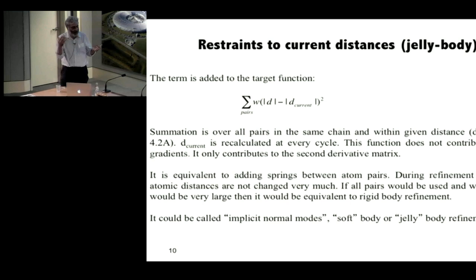Reference structure restraints and secondary structure restraints are designed to select, among many models, the best possible models that are structurally sensible and that can give us some information. And one of the tools we use is so-called jelly body refinement. What does that mean? That jelly body refinement.